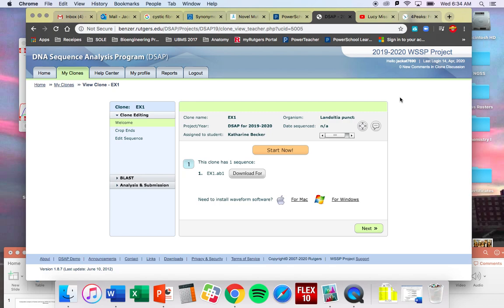You'll scroll through and find your clone name. So my name's Jacqueline Katz. If I was looking for my unknown clone, I'd be scrolling through looking for 110JK1.19. Okay. So you're looking for that 110, your initials, 1.19, unless you get an email from me and you're going to be looking for somebody else's clone name, and you'll know who you are. All right, so once you download that clone to your DSAP, it'll show up on your main page. You'll be able to start analyzing it.